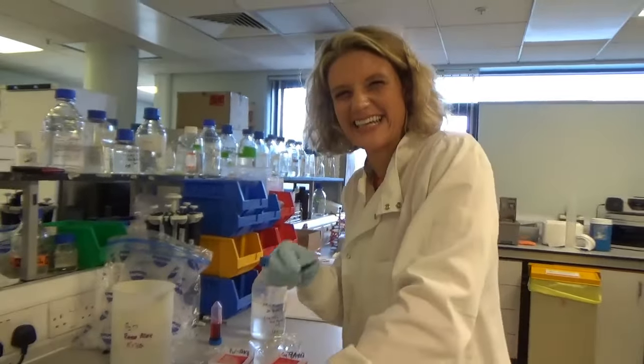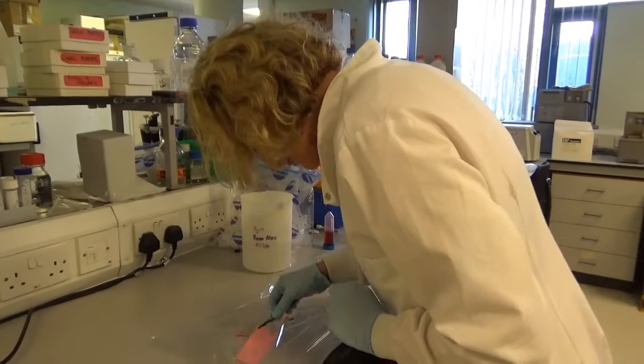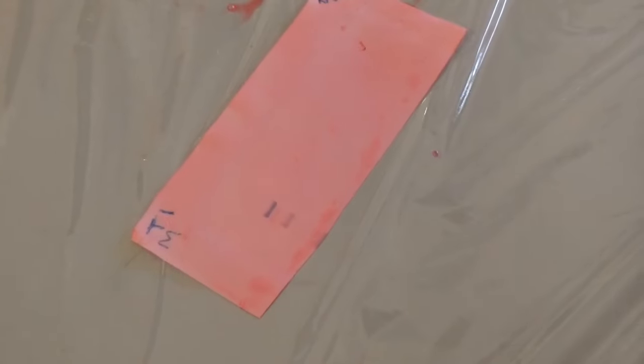Should we keep going until I find it? Welcome to science. This is science. There is actually some protein on this one, right at the bottom. There's like a little smear of darker. Can you see that? So this is the ladder. This bit here is the ladder that tells me how big my proteins are.